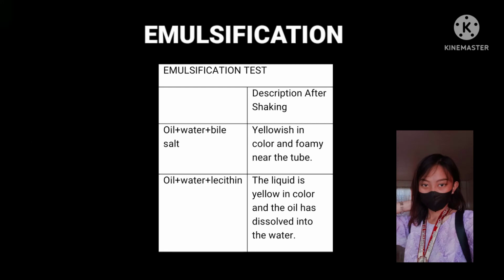For emulsification and bile salt, the description is yellowish in color and it formed a foamy texture near the tube. Then we have oil, water, and lecithin. It is yellow in color and the oil has also dissolved in the water.